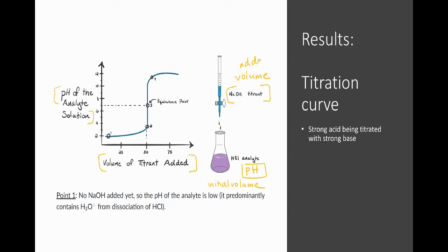from the titrant. Now in this specific example, at the bottom we have an unknown acid, HCl, being titrated by a known concentration of base, NaOH. So at first, when you're measuring the pH of your analyte, the pH is going to start out being low because it's an acid. But if you continue dropping in base, the pH is going to start to rise, all right? And as the pH rises, it forms this S-shaped graph. All right, and so your graph will level out at a high basic pH if you continue adding the base throughout the titration.